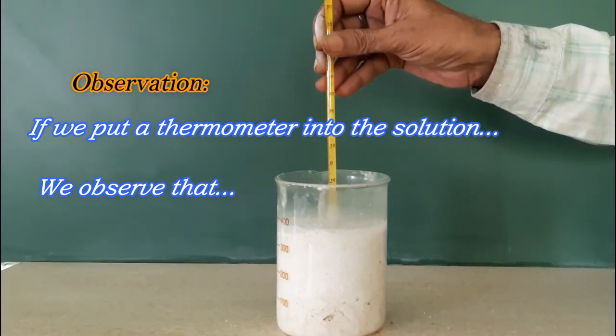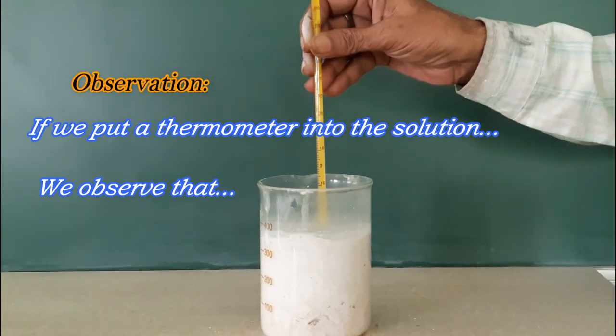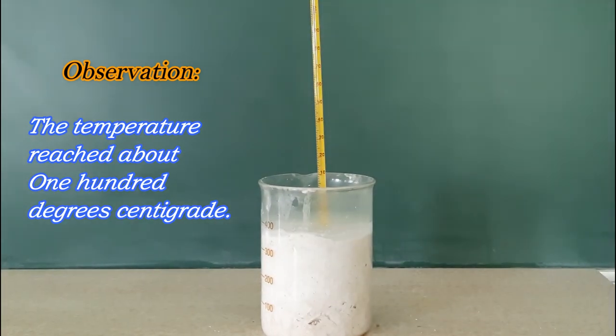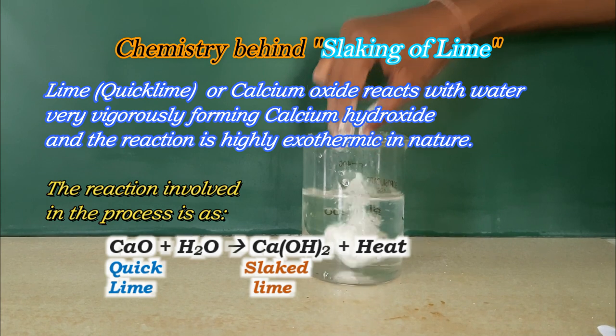If we put a thermometer into the solution, we observe that the temperature reached about 100 degrees centigrade. Chemistry behind slaking of lime.